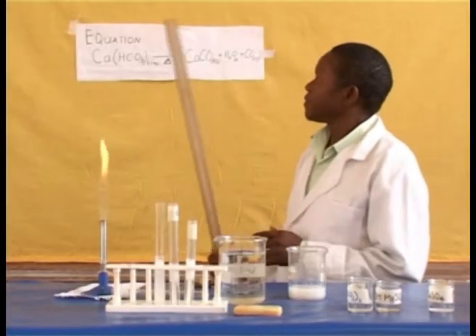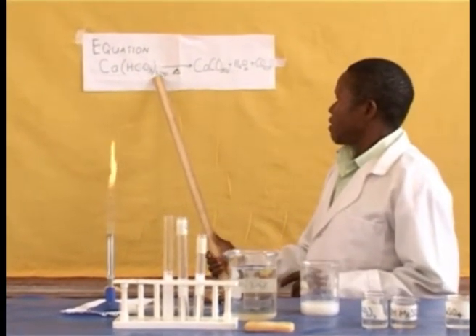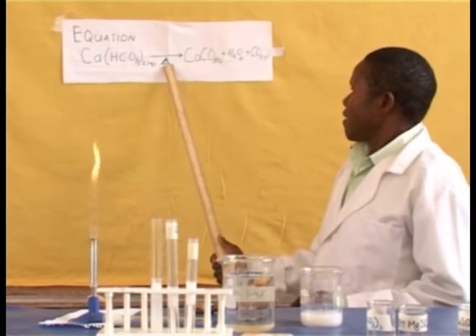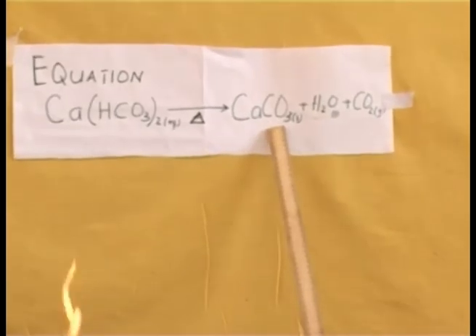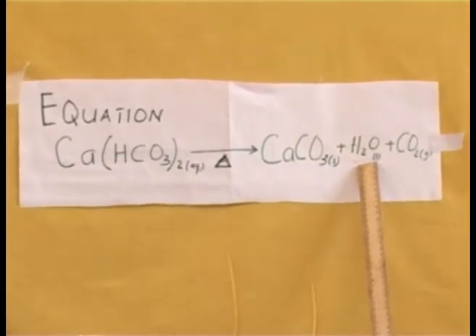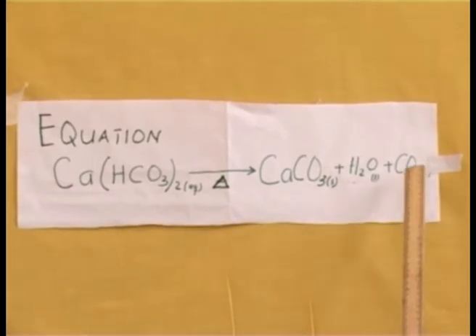During heating, the calcium hydrogen carbonate in the solution decomposes to form calcium carbonate solid, water, and carbon dioxide gas.